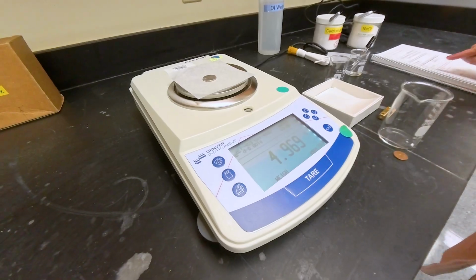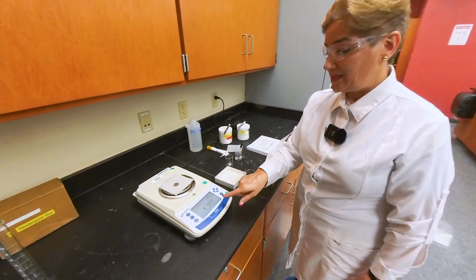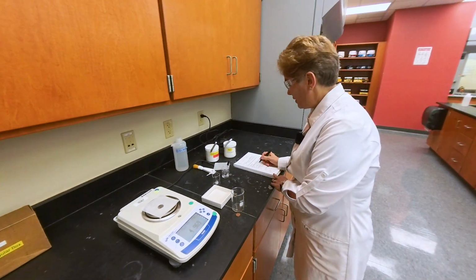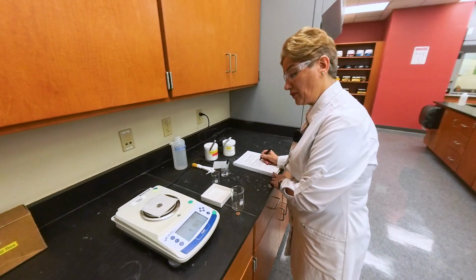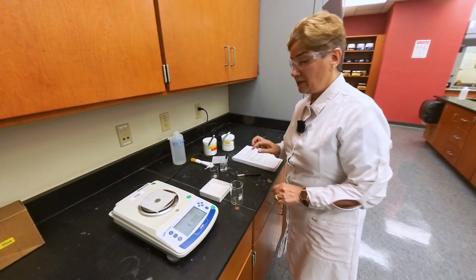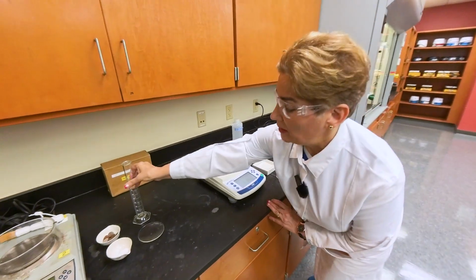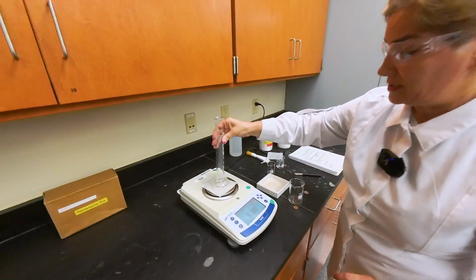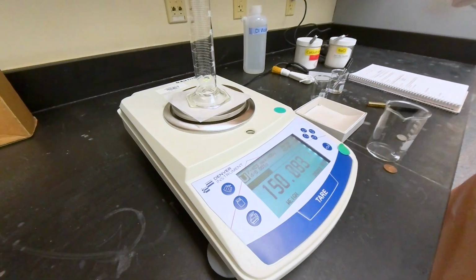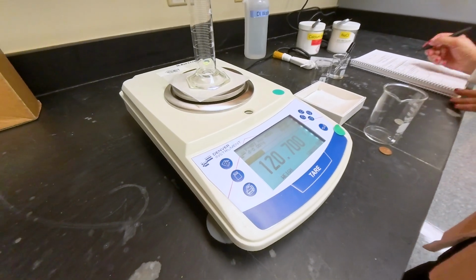Now I have a nickel on the scale, and that's the mass. We are going to focus and record the exact number we have for the nickel. Next item, 100 milliliter graduated cylinder. So I remove the nickel and place my 100 milliliter graduated cylinder. I want to make sure it's 0, and I place the 100 ml graduated cylinder. Record that number.